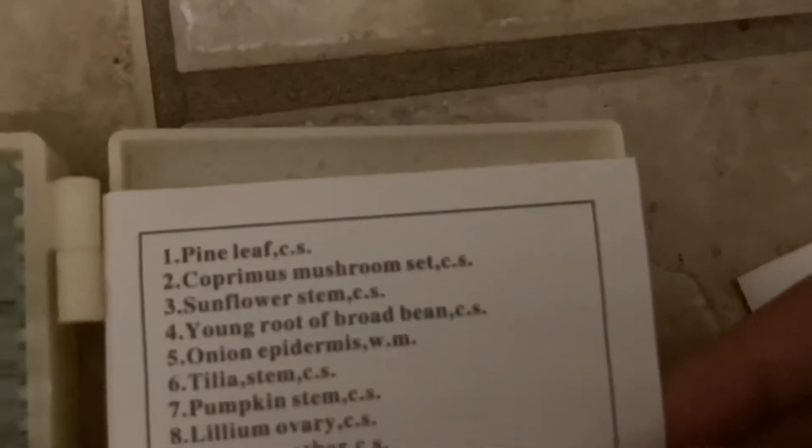Number one would be pine leaf — so number one, which is this one, is also pine leaf because here it also says pine leaf.